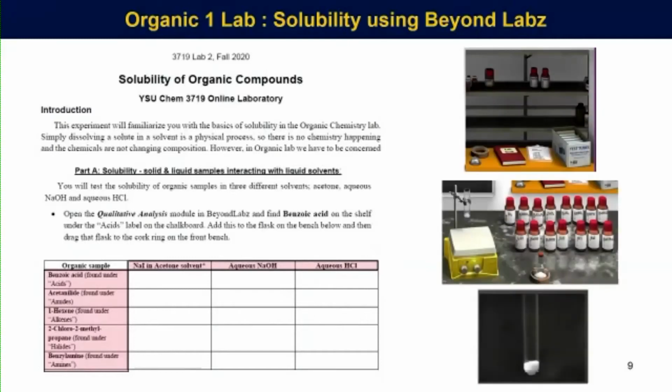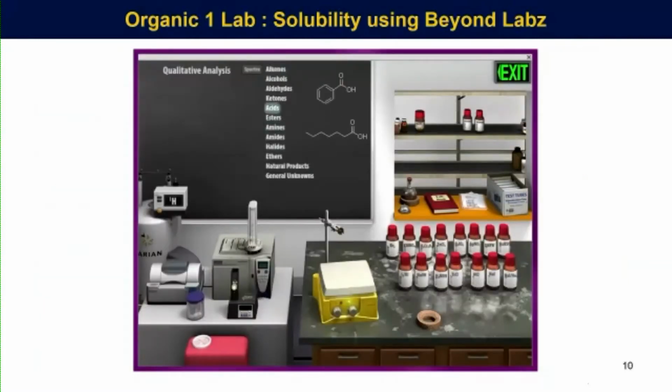So this was great because it's the first introduction to Beyond Labs that they saw. It's in the qualitative analysis section, which is stripped down and easier to use than the synthesis section. So we got them started here, and they were able to take materials from the shelf and put them into flasks. And then the very clever videos were really well received, that they can see the actual dissolution as things go. So I put together a few little videos here about how we use this.